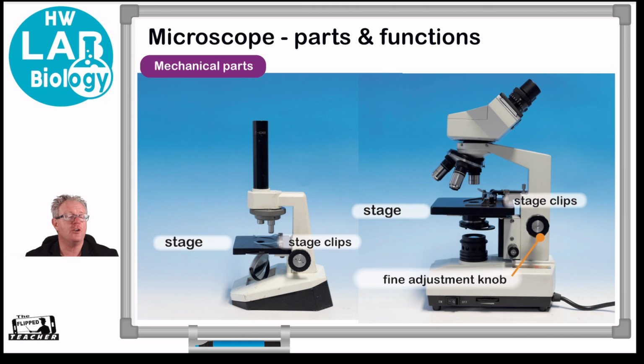So that's it. That's looking at all the parts of the microscopes for this video. Make sure you've got these down in a table. You've got like the parts and then the functions. Some way that you can memorize all the different parts of these, because when you go to use them in the lab, you need to understand what they do.